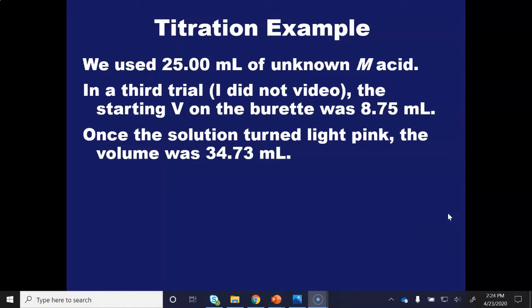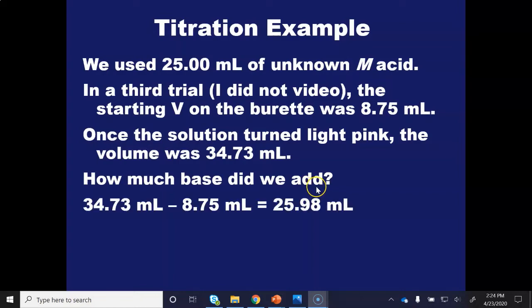So how can I use these two numbers to find the volume of base that I added? Well, that's essentially just a subtraction problem. I didn't start at 0.00 milliliters because there wasn't any reason to put 50 milliliters of solution in there. I don't need to waste the sodium hydroxide. So I'll take my ending volume and subtract where I actually started, and that gets me 25.98 milliliters. And so that's the same process you would use for any titration to determine the milliliters of titrant that you add. You subtract the initial volume from the ending volume.